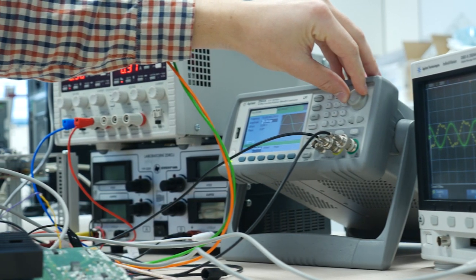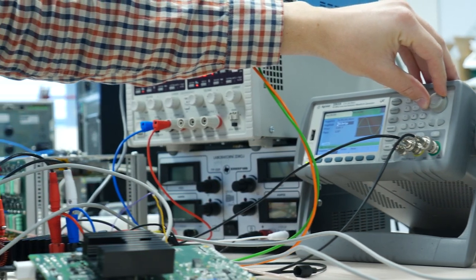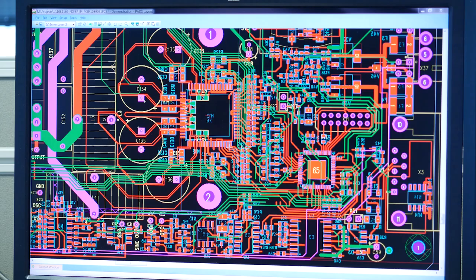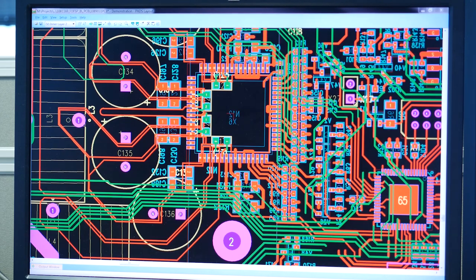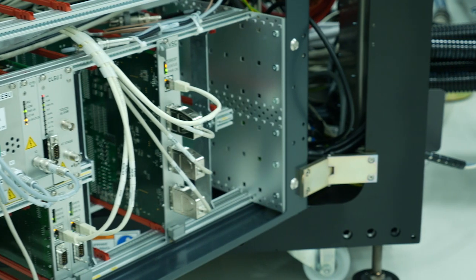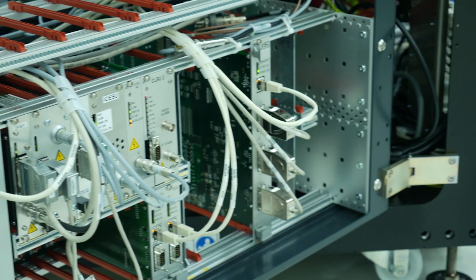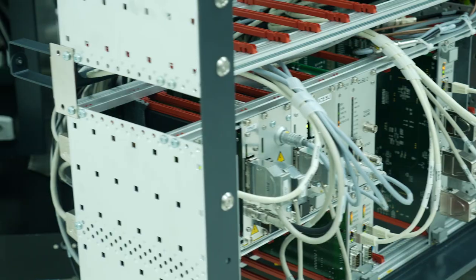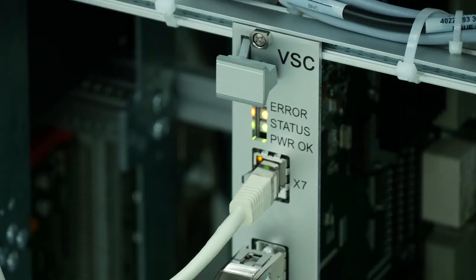So we get back to the drawings of detailed electrical diagrams. Precisely. And only after that, the boards of printed circuits are designed and the parts are soldered onto them. And here's the result. Sorry, but this really looks like an ordinary board that I have in the back of my computer. No. With regard to specific requirements of the microscope, its design is at the cutting edge of feasibility. Requirements for precision, time and temperature stability of current and voltage sources are usually stated in ppm.